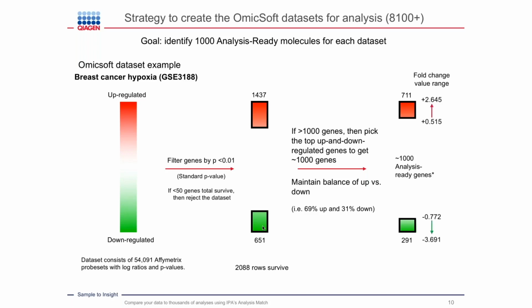And just to note, sometimes what you're going to see when you're doing the analysis is that, oops, what's going on here? Oh, sorry. Sometimes you're going to see 1,000 genes. Even if you try to aim for 1,000, sometimes what gets uploaded is fewer than 1,000. As I mentioned before, sometimes you may get to 1,000 and it's close to 1,000. You might say, okay, let's call it a day. But in some cases, you've gone to about 1,000, and the reason you see fewer is because some of those identifiers were duplicates for the same gene, and IPA only picks one identifier per gene, or they're merged into orthologs when they're uploaded into IPA.